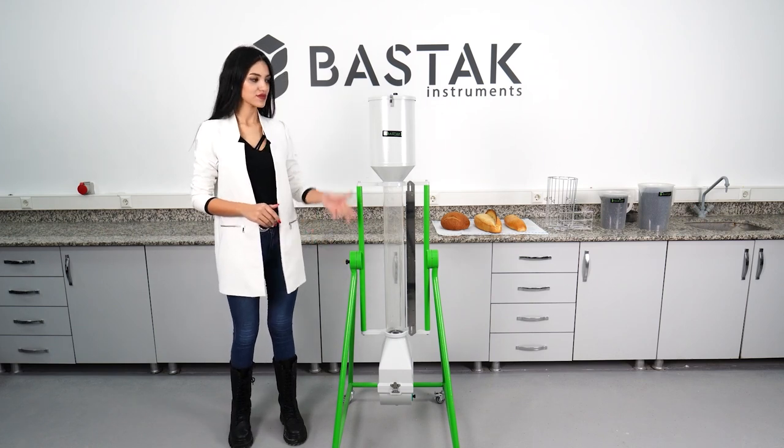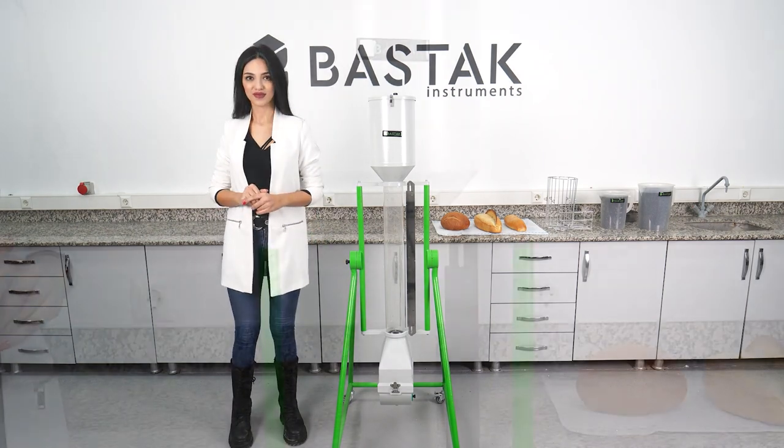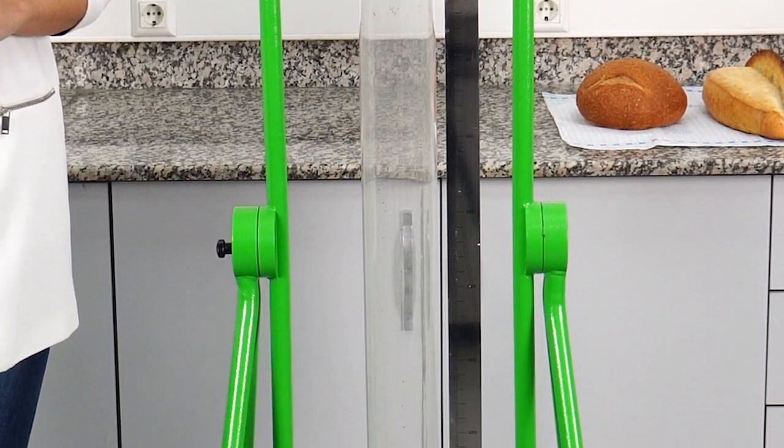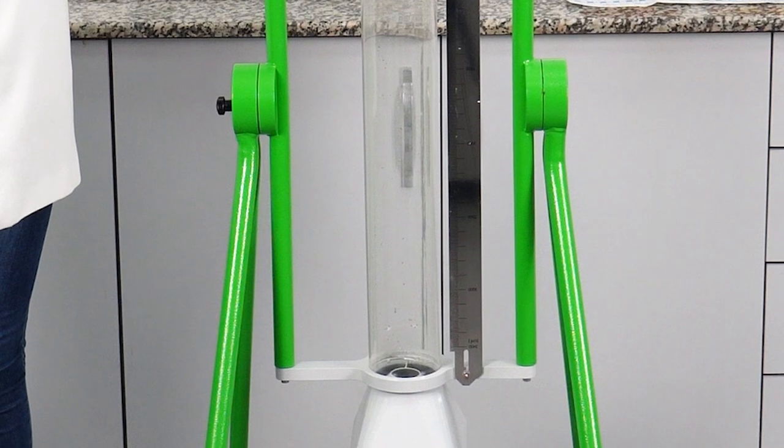Using the Batac brand 13300 model bread volume measuring device, the volume measurements of baguettes and French bakery products are conducted according to international standards.